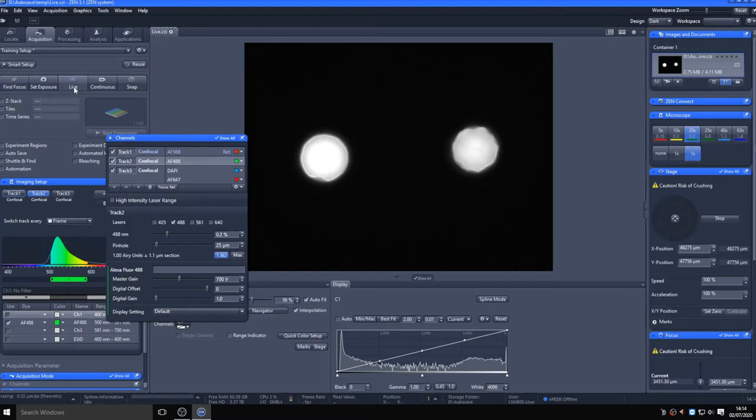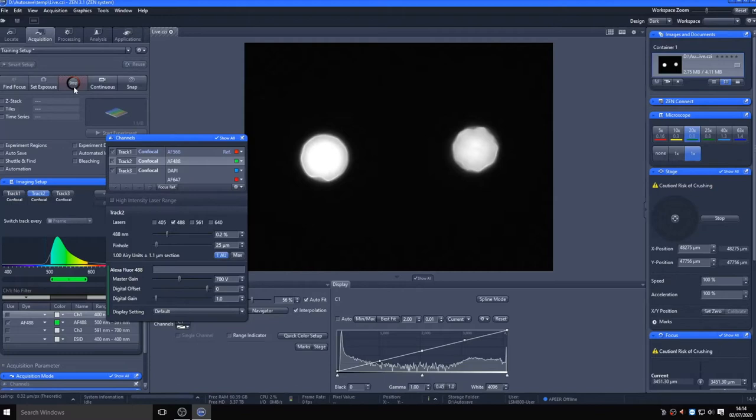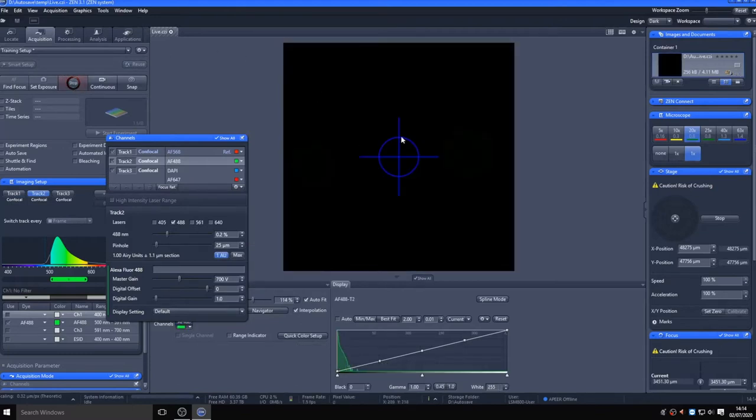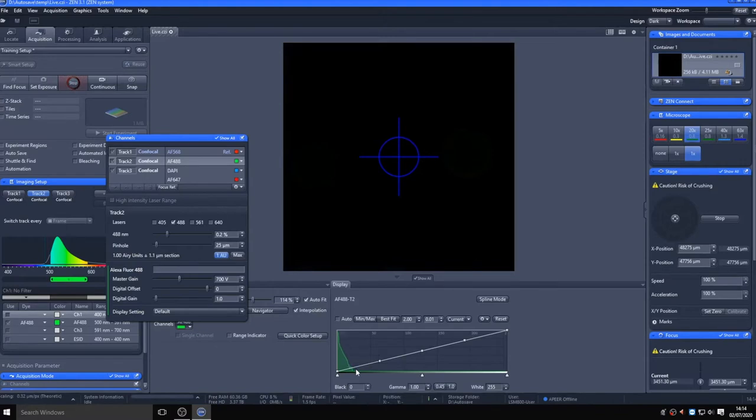Once you are happy with the detection parameters on each of your tracks, you can either decide to set the pinhole to a set diameter for all or have it modified to one airy unit for all channels if you are using frame mode. This ensures the optical sectioning is set the way you want for each channel. Now you are able to go live on your image, and a 512 by 512 pixel image will be visualized at high speed to allow you to fine-tune focus and set the desired laser intensity and gain settings.